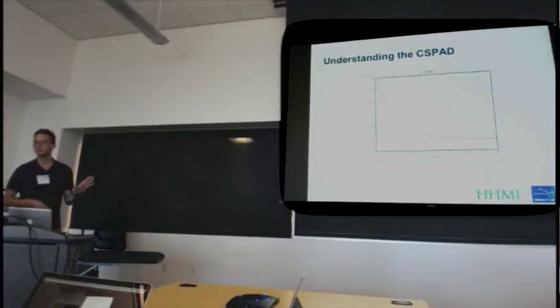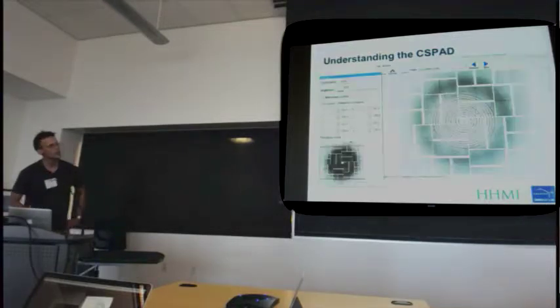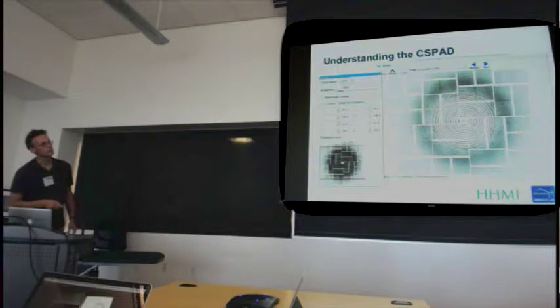So given the time constraints that we had at the time, we abandoned this, or put it on the shelf, at least for the time being, to maybe take it back at some later stage. So instead what we have, and you've seen the slide before, is something that Nick then wrote up, to look again at these composite images and overlay a ring pattern.